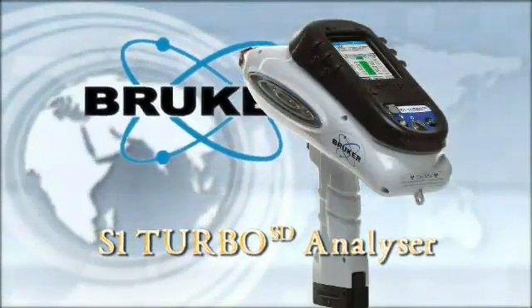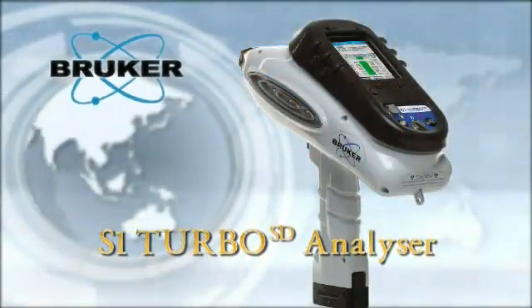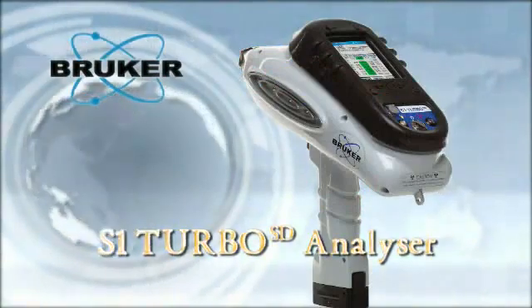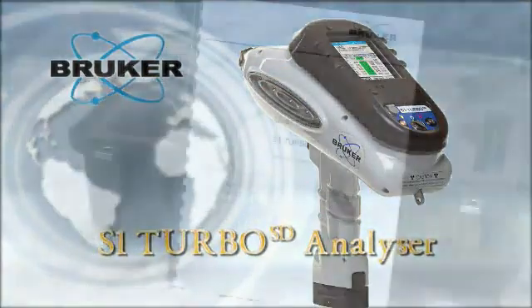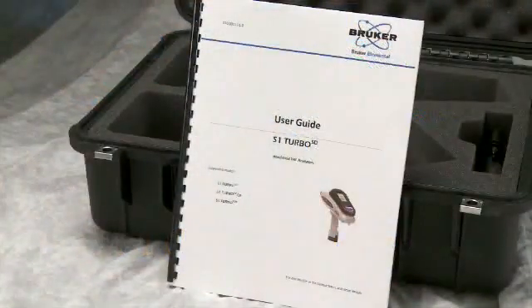Congratulations on your purchase of the Bruker Elemental S1 Turbo SD Analyzer. This video was developed to help you better understand the operations of this unit and its accessories. For more information, consult your user's guide.